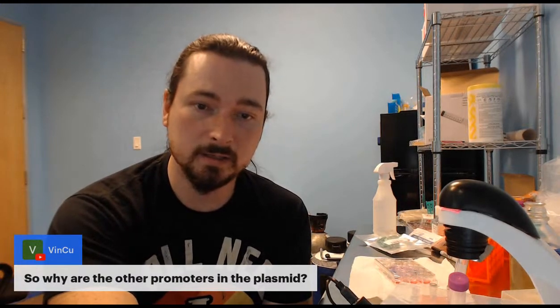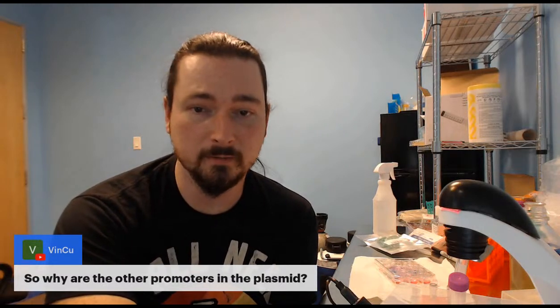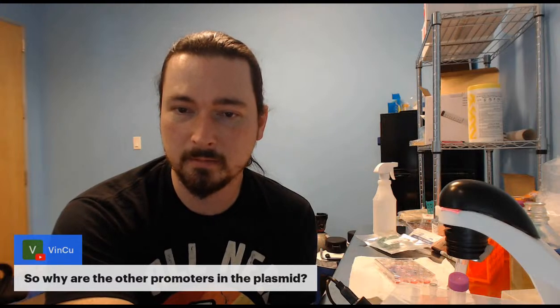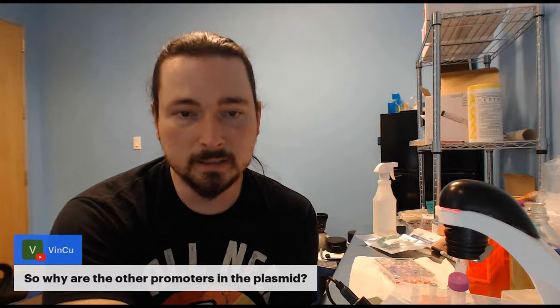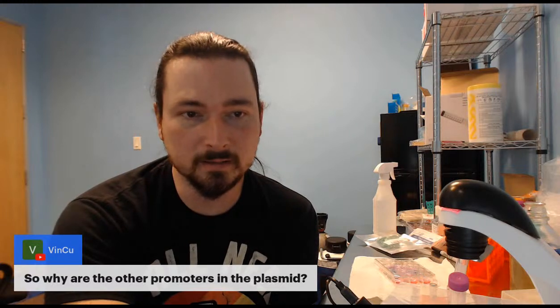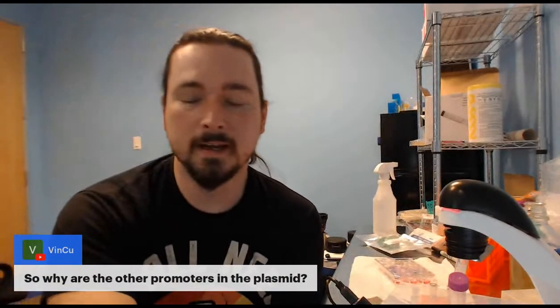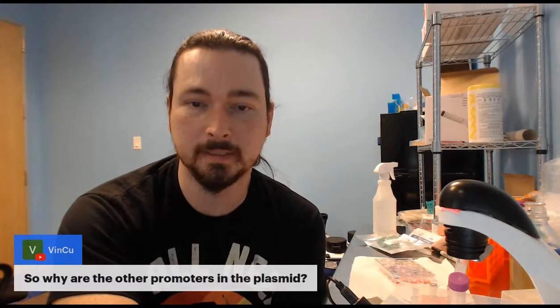And this one is mostly here as a sequencing site, but it's also a promoter. So in theory, you could probably do some expression. I've never tried it in BL21. I could try it, but I don't see a terminator that would work for us. That doesn't mean you won't get any expression; it'd just be weird.